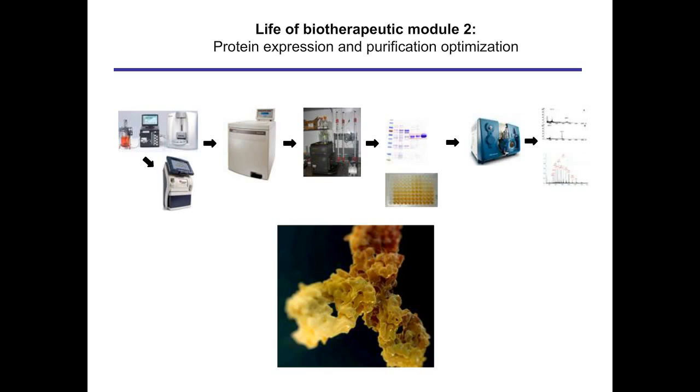And typically a cell line is developed and the health is monitored with something like the ViCell that will, through Trypan Blue, measure percent viability during the cell culture process, or the Metaflex, which measures the changes in the glucose and other metabolites.